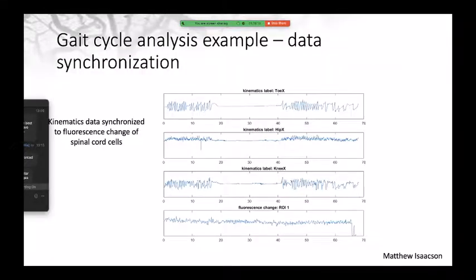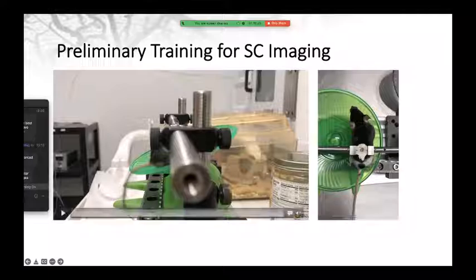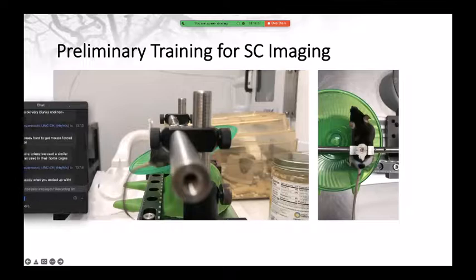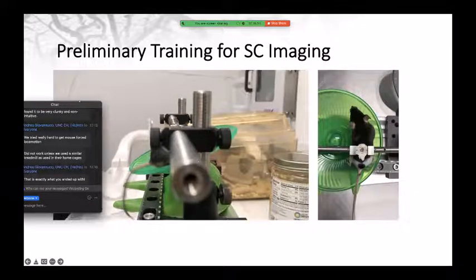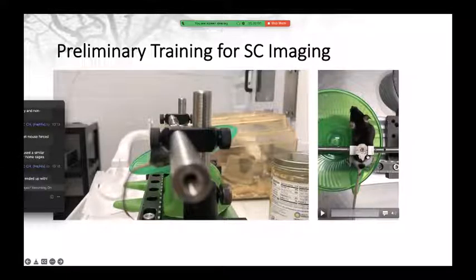All right. So the new stuff, because of the quote unquote frustrations of working with the linear treadmill, I had to try something less sophisticated than the linear treadmill with all the electronic stuff added to it. I just used the same treadmill and put together the same graduated posts, along with the spinal cord imaging clamps. This is just a prototype version on the side here.